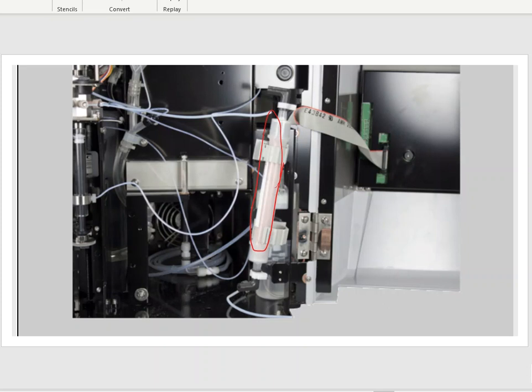That's it, folks. That's all that we have to do to replace a halogen scrubber. So please do not call someone in from Shimadzu to do this for you. Anyone can do it. And then after you replace that piece, you just want to make sure that the machine's working properly again. Make sure and confirm that you're getting good quality data. And then if you do, away you go. You can start your analysis all over again.